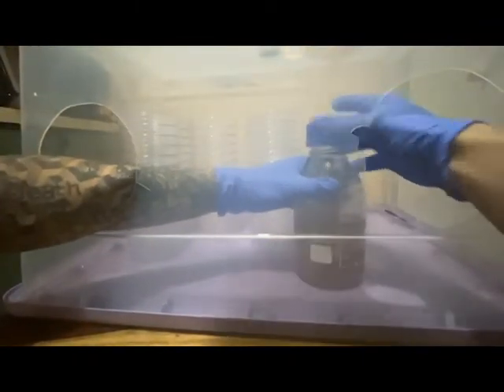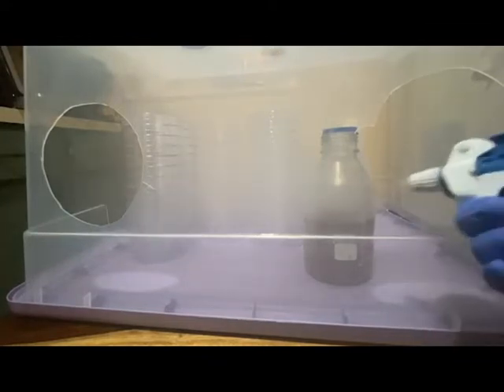Also, for those that don't know, agar has to be poured in a certain temperature range, which I believe is 107 to 117 Fahrenheit. Sometimes I pour a little hotter than that. Sometimes I'll go as hot as, I don't know, like 120, 130, just because I have to do so many at once.